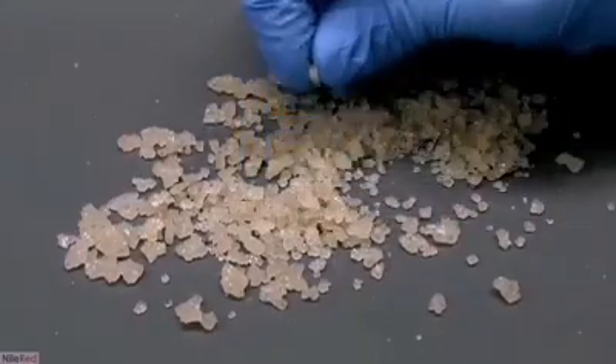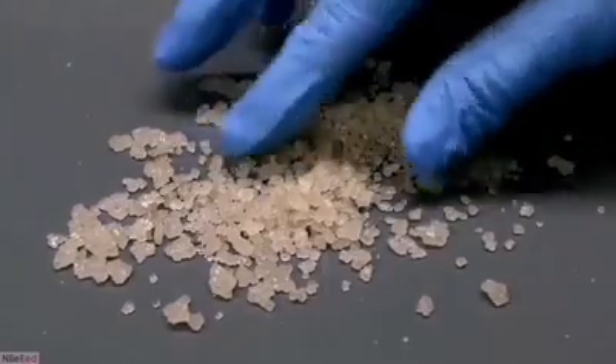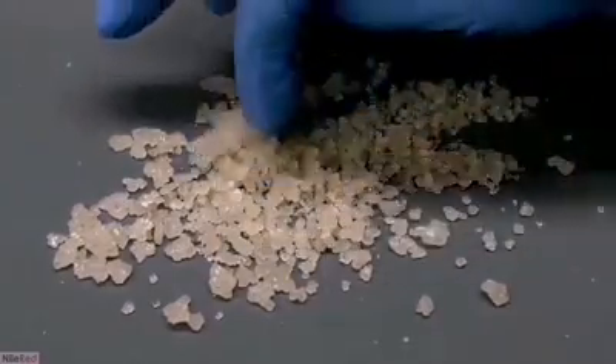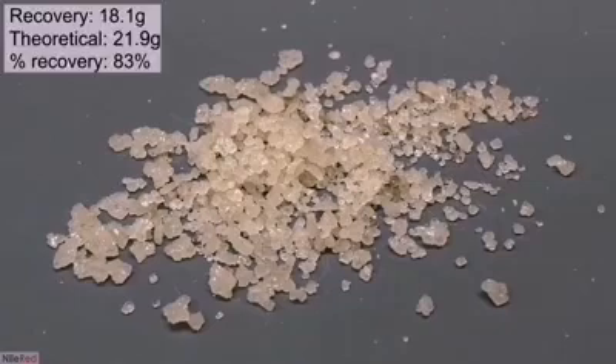Going back to the overall shot of the crystals, you can see they're all pretty yellow. To clean them up, I could crystallize them in water like I did before. However, this process is really slow and I didn't think it was worth it, considering I can just buy citric acid from the pharmacy. In total, I recovered 18.1 grams of crude citric acid. A paper I found online claimed that lemon juice has about 1.44 grams of citric acid per ounce. Starting with 450 milliliters, the theoretical amount should be about 21.9 grams, giving a percent recovery of 83%.